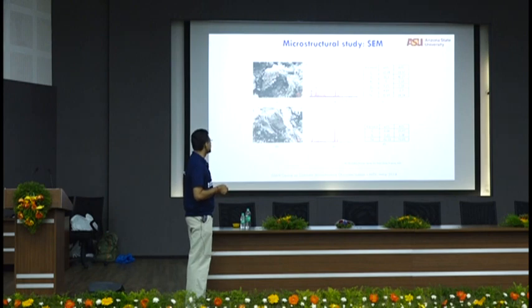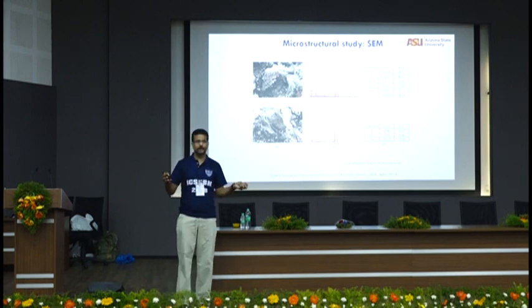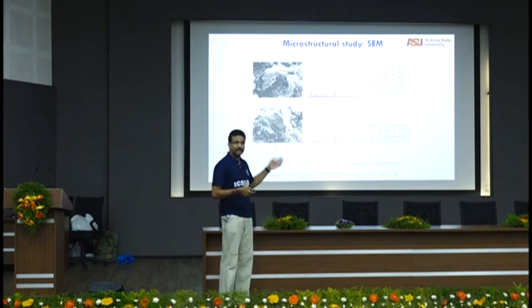Yeah, total ideally should be equal to 100, but I might not have added some of these very minor peaks of something else, so you would have missed it. You don't have to manipulate, no. So that's another thing. A lot of people have this misconception, everything has to add up to 100. Theoretically, everything has to add up to 100. But there are so many things that you might not have figured out. There are so many things that you might not want to know. There might be some manganese there. Who cares if there is manganese?